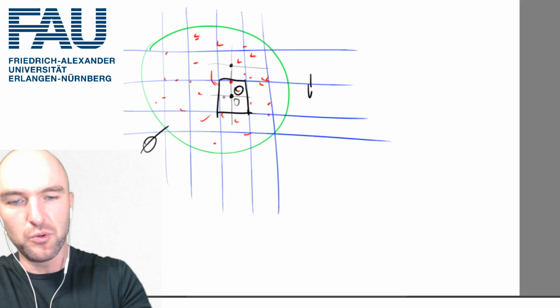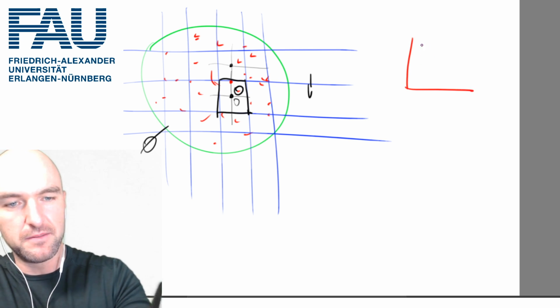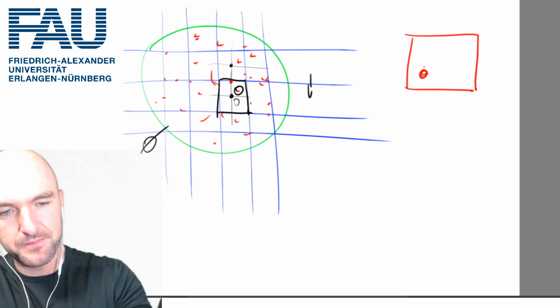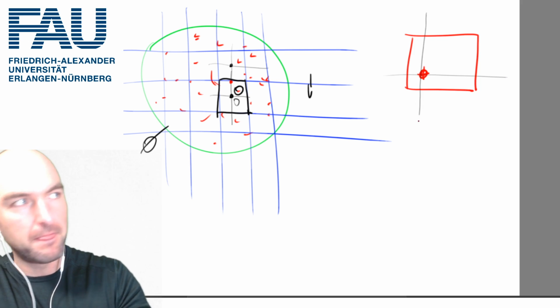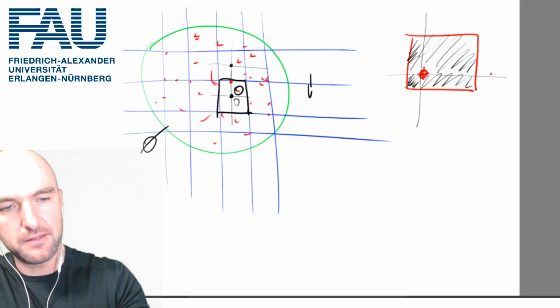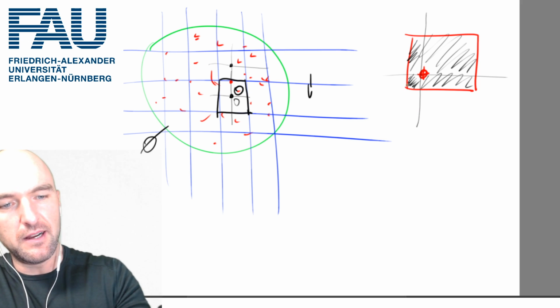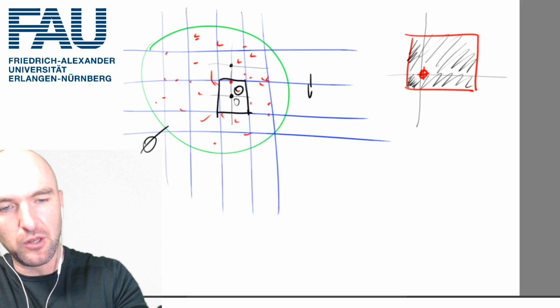Essentially, I draw it in 2D, and I hope it's reasonably understandable in the translation to 3D. So if this is our voxel and our atom sits here, what I can do is partition the voxel and use these respective reciprocal areas to define by which percentage this atom will belong to each of the corners.